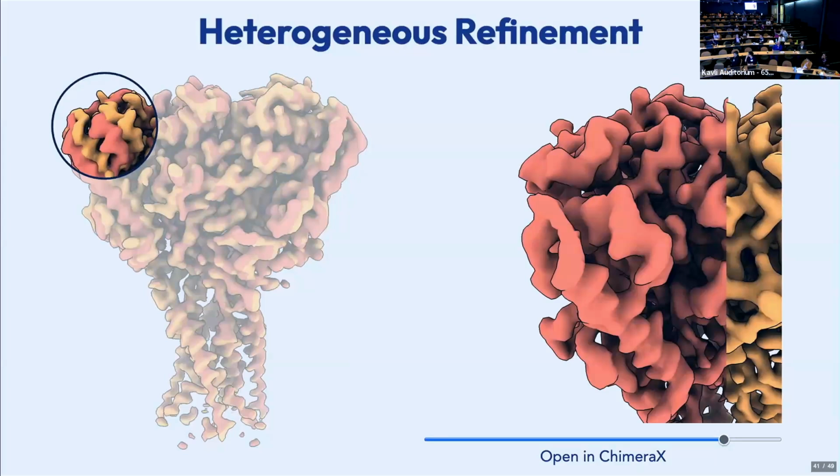That's okay. So the question was, what's the particle number in this map? I actually don't remember, unfortunately. Certainly fewer than 1 million and more than 100,000, but that's the order of magnitude. I'm sorry, I forget for this exact job. Sorry.